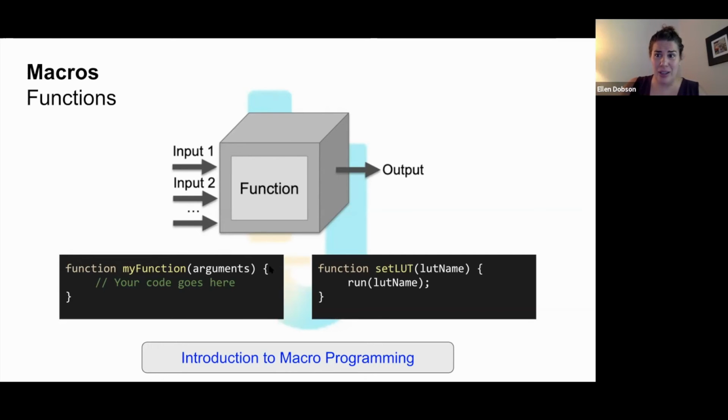And this is kind of the verbiage that we use. You start with the word function and then the name you want to call the function. You have to say function to declare that this is a function. You can name it. In this case, we just say myFunction. The convention is that you start with a lowercase, and then for each word thereafter, the first letter of each word is capitalized, without any spaces or dashes or anything.